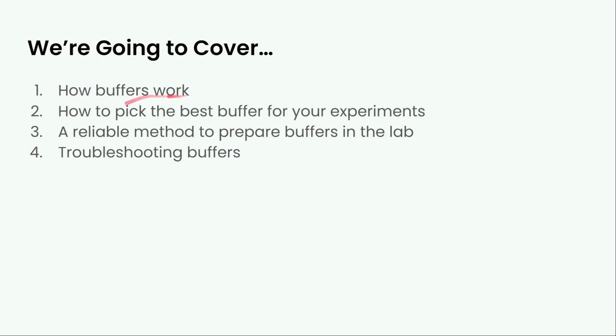resonate with you. And then I'm going to go through how to pick the best buffer for your experiments, so some theoretical considerations and some practical considerations. I'm going to go through a reliable method to prepare buffers in the lab, the way I used to prepare them back when I worked in the lab full time. And then I'm going to go through troubleshooting some issues that might come up when you're working with buffers in the lab. And as Adam says, if you have any questions, just pop them in the box and I'll do my best to answer them at the end.